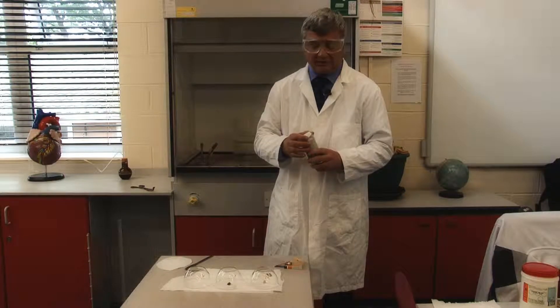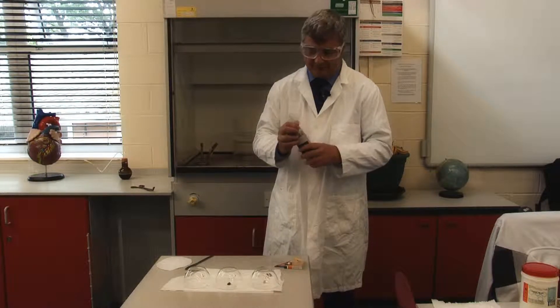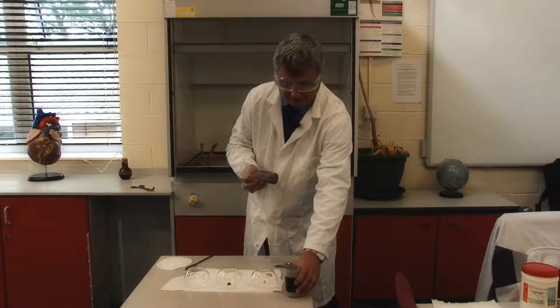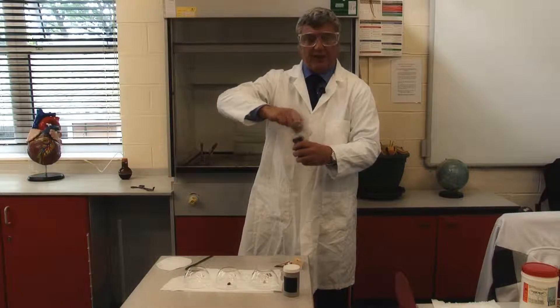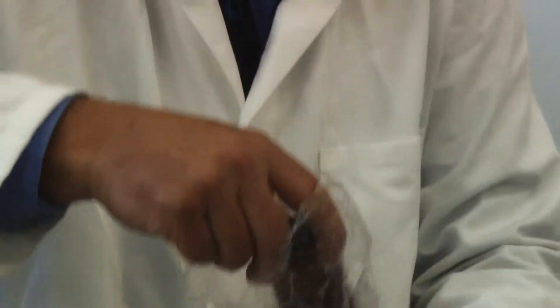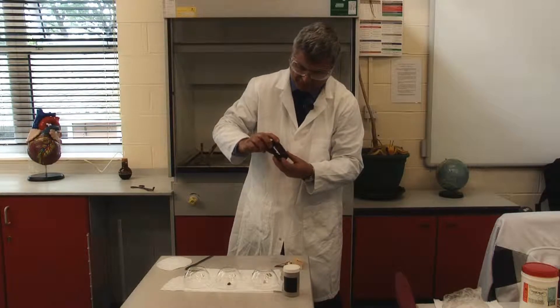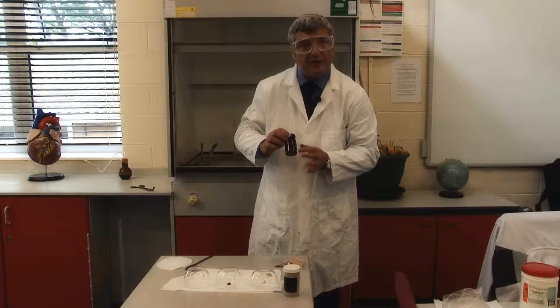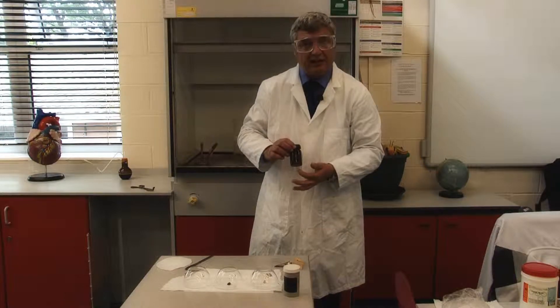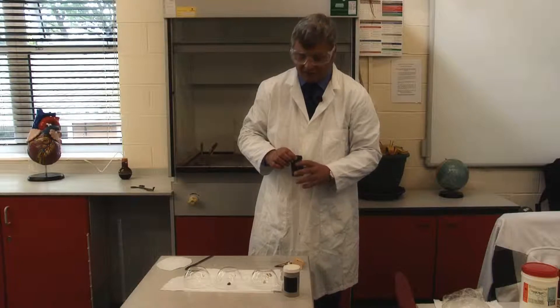Just like the previous two metals, potassium is stored in a container inside a container, usually or often in a plastic bag as well. And as we can see, it's stored under oil, but just like sodium it's not floating on the oil — it's sunk. So this is higher density than lithium.